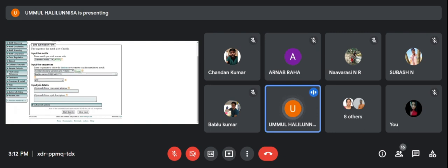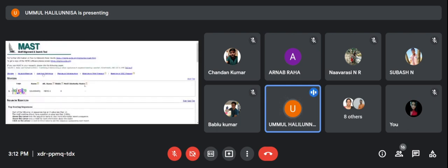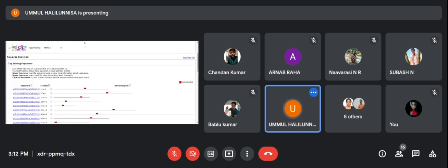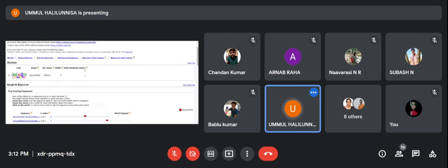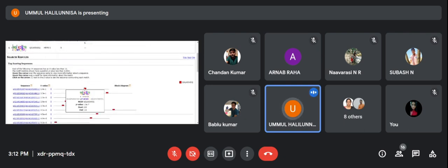Now we have to start searching whether what I have given is present in that Bacillus or not. I have chosen the database which has the genomes of GenBank genomes and proteins, and in that I have chosen the family of Bacillus cereus. So in that whole thing, this kind of motif is present in these regions.